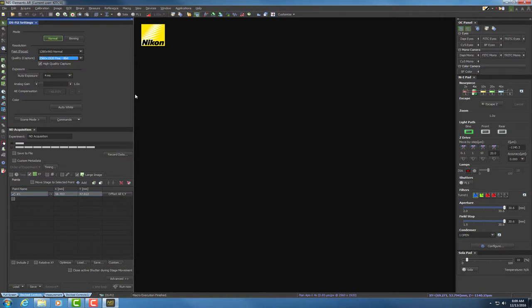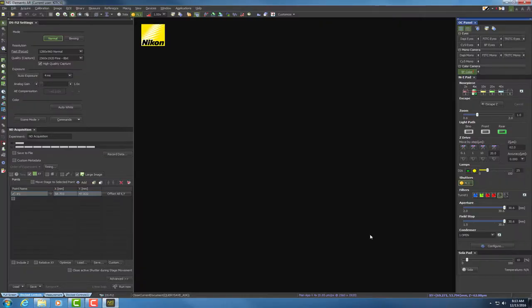At this point, we're going to find our tissue using the Brightfield eyes under the microscope. Click on Brightfield eyes in the OC panel on the right-hand corner — you'll hear the shutter opening. We've found our tissue. The controls for the objective are on the right-hand panel. We're going to start out at 4X and do a tile scan first, then take individual images. The objective is already set at 4X, so we're good to go.